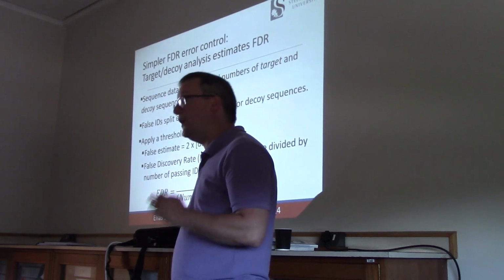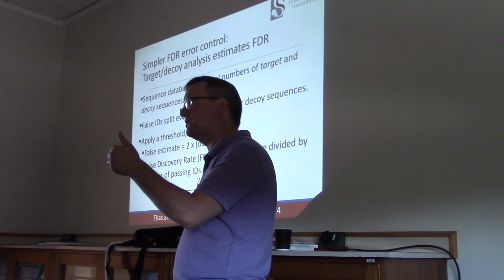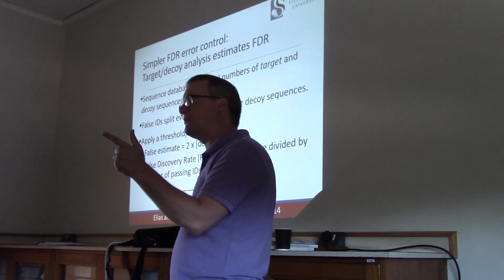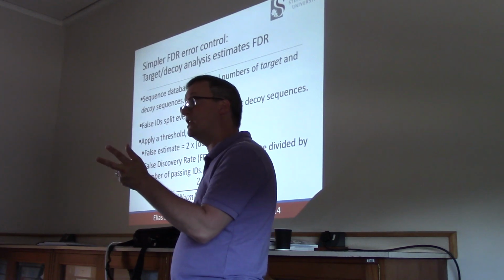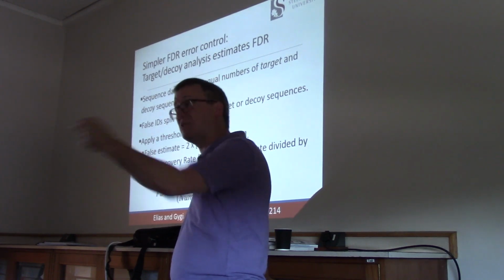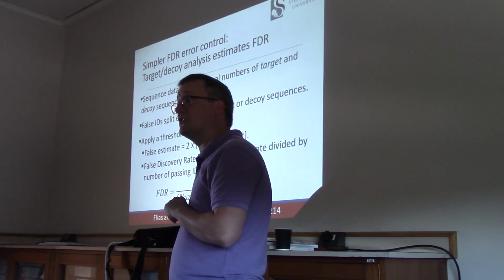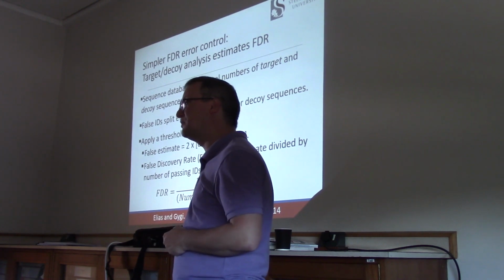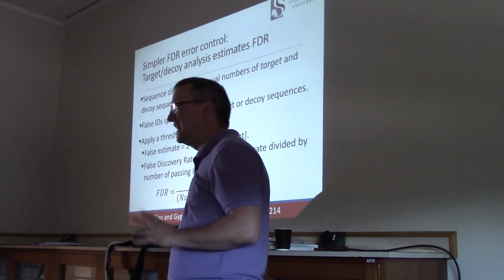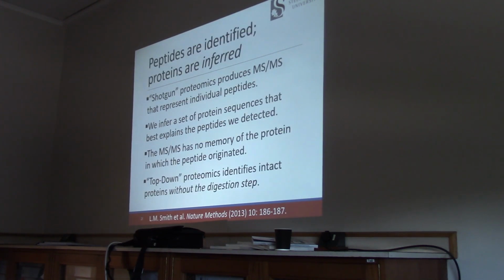Today, it's quite typical that if you're using a data set with high mass accuracy precursors and high mass accuracy fragments, collected from samples in which you have enough protein quantity, that you can identify 50% of the spectra that you collect. But it's still the case that there's going to be half of your data that can't be confidently matched to a protein sequence. It's an awkward place, but it's where we are in the field. It's a whole lot better than it was a few years ago.